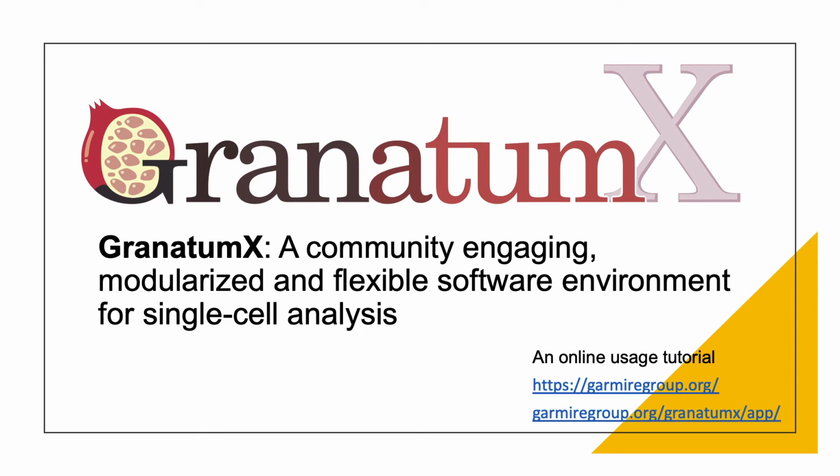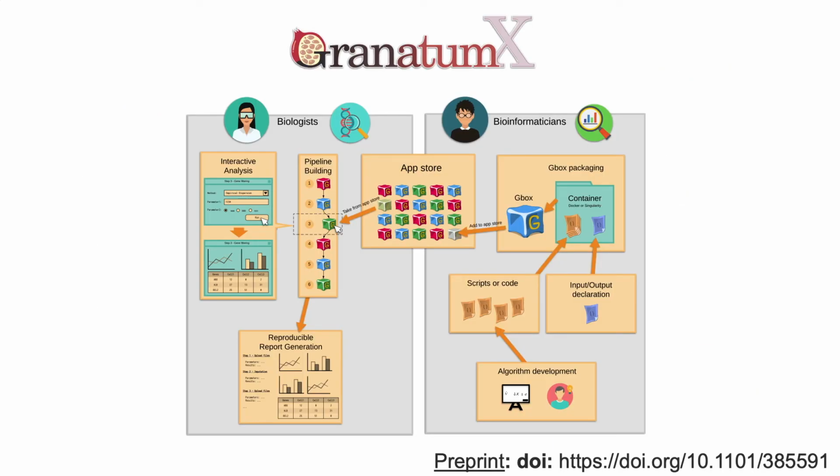In this video, I will give you a brief introduction and a demonstration of the usage of our online single-cell analysis platform, GranatumX. GranatumX is a community-engaging, modularized, and flexible software environment for single-cell analysis. The goal of GranatumX is to provide biologists a better access to bioinformatics tools and the ability to conduct single-cell data analysis independently without prior knowledge in any programming language.